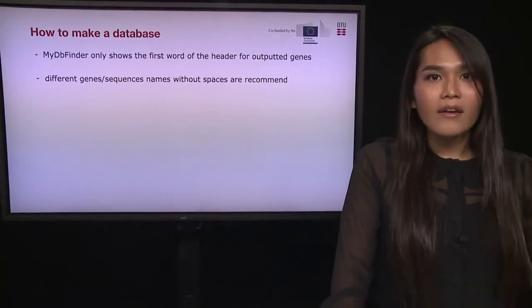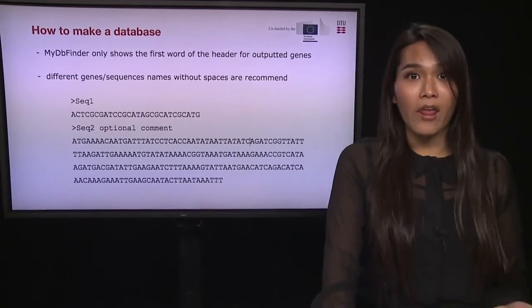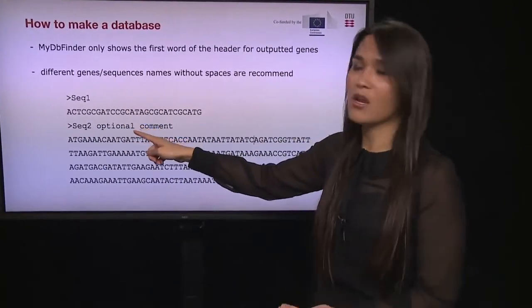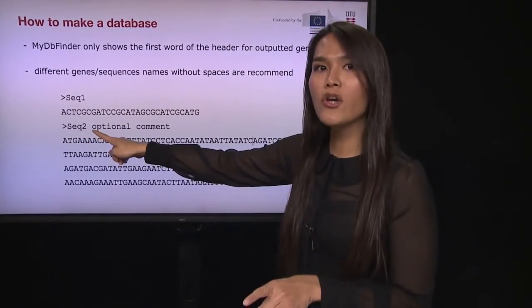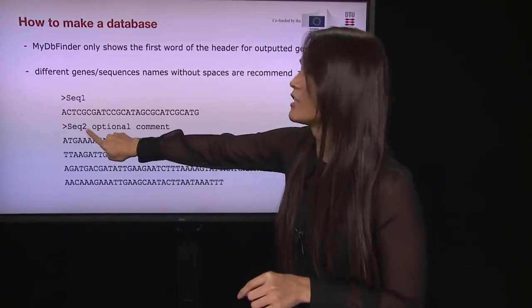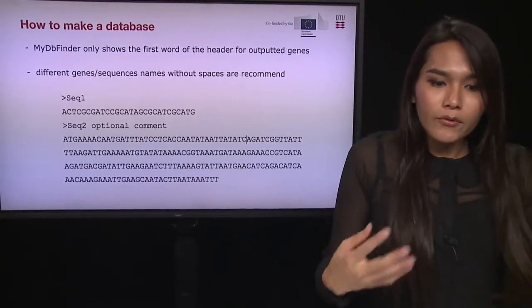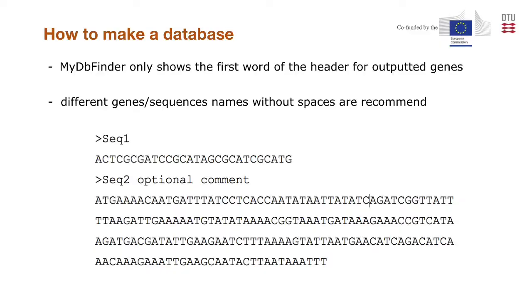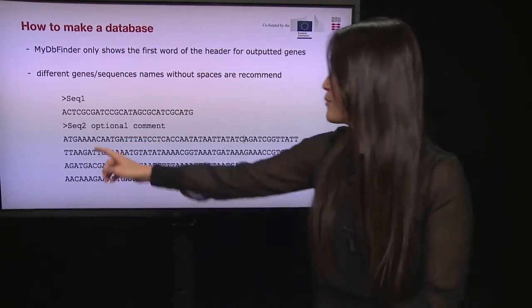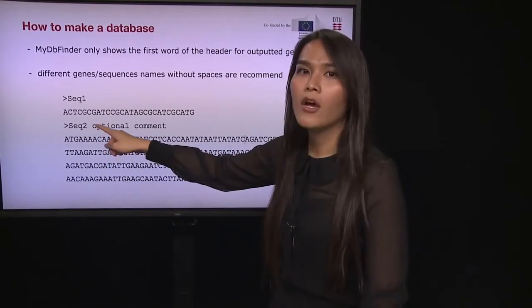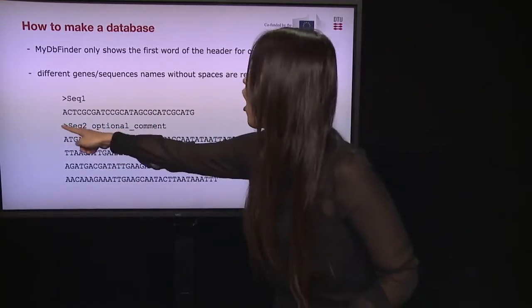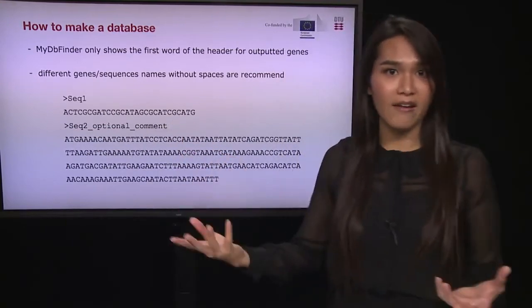MyDB FIDER only shows the first word of the header as the output gene name. For example, if your unknown sequence matches sequence number two, it only shows 'sequence' — it breaks when it finds a space. We recommend using sequence names without any spaces; use an underscore instead. Then the program will show all the header information in the output page.